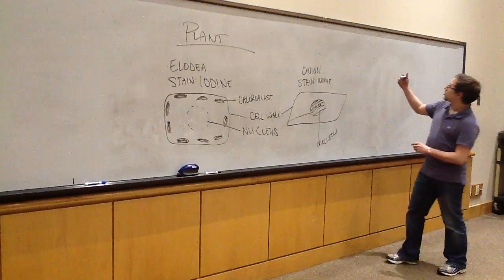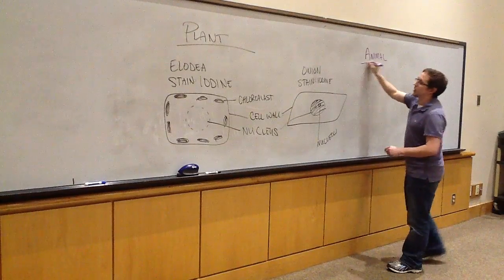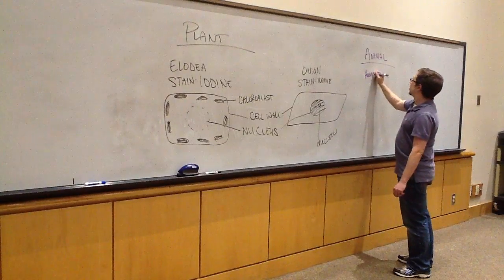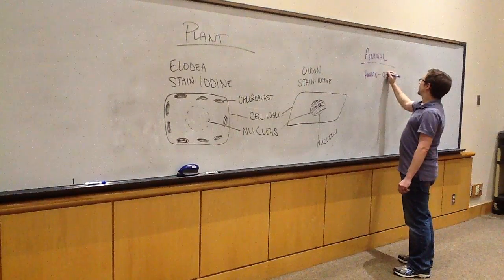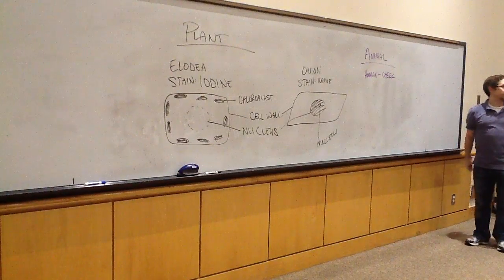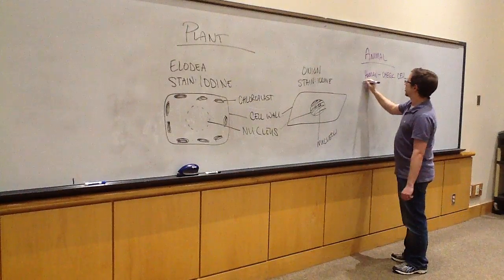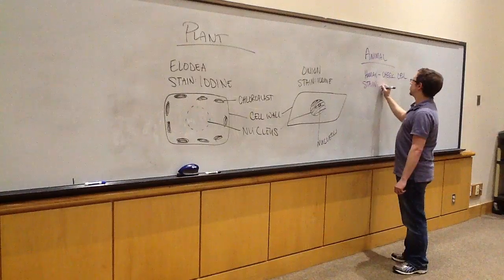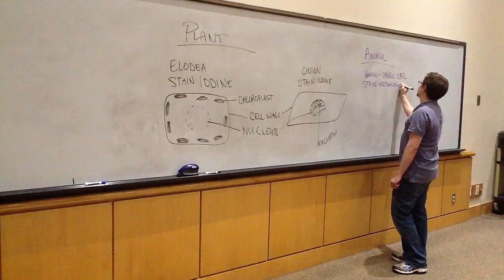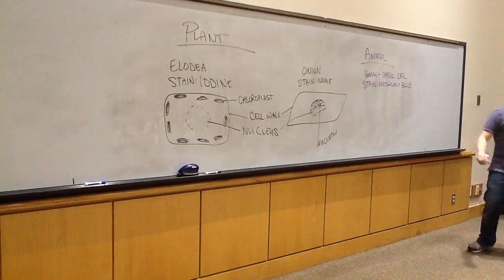Now, outside of plant cells, we also did animal cells, right? Okay, and what animal in particular did we focus on? Humans, specifically. Yes, specifically your nasty cheeks. I'm just kidding. We did use cheek cells, and what was our stain that we used? Methylene blue. Good. Trick question, what was the color of this stain? Blue. Good. If only that were a question on the practical, huh?